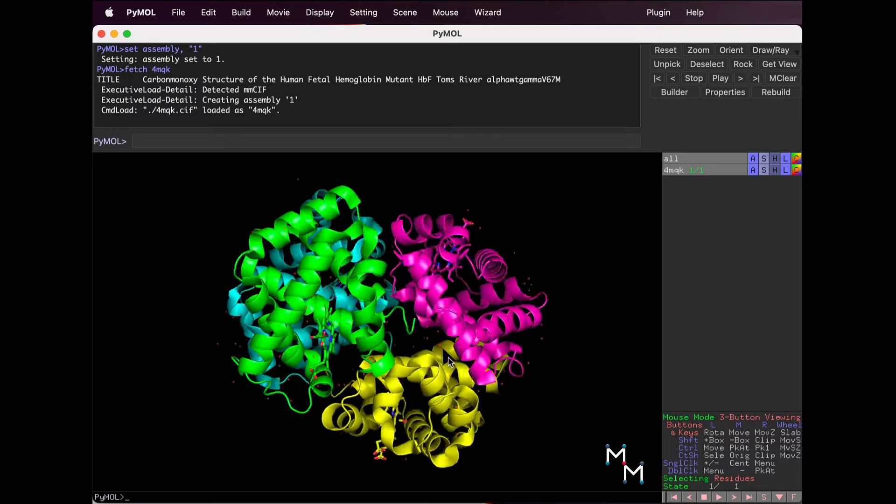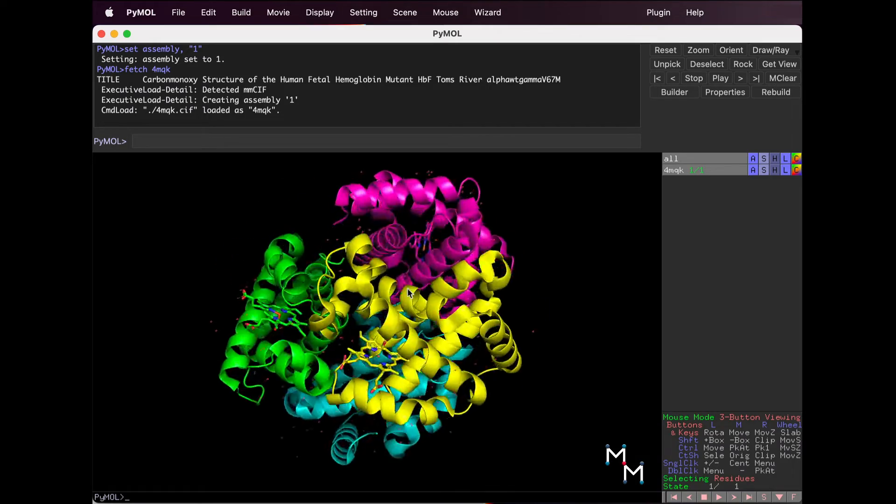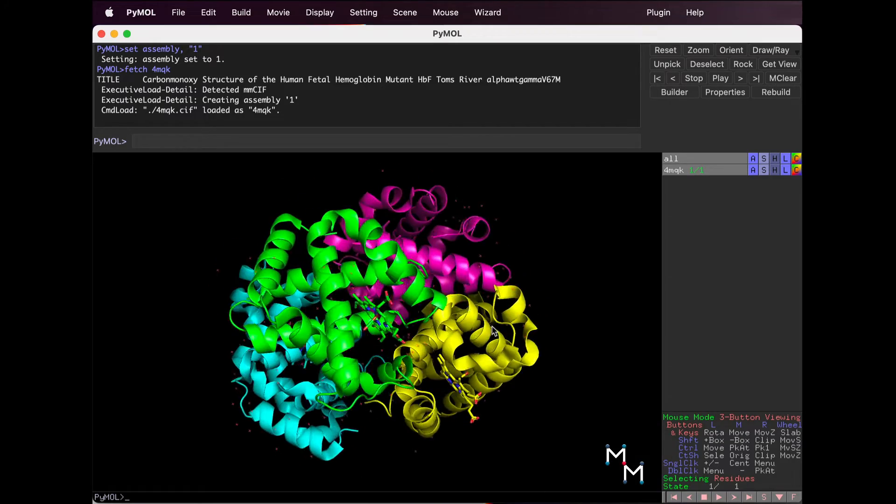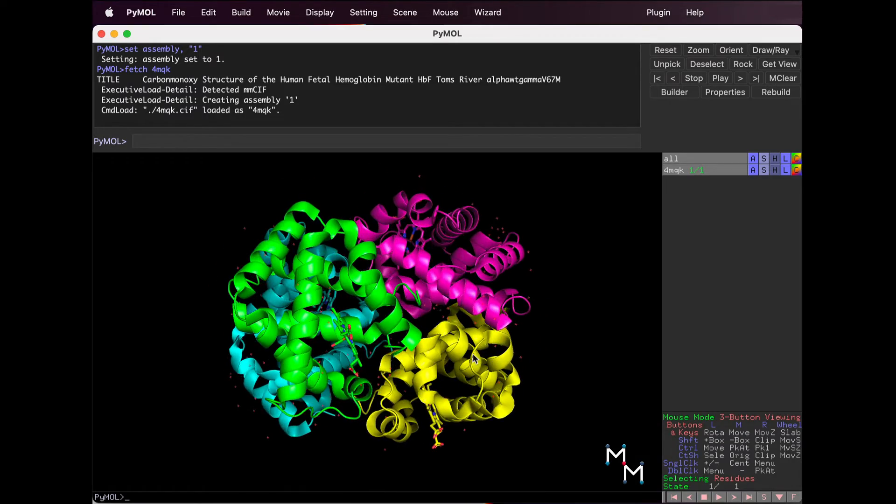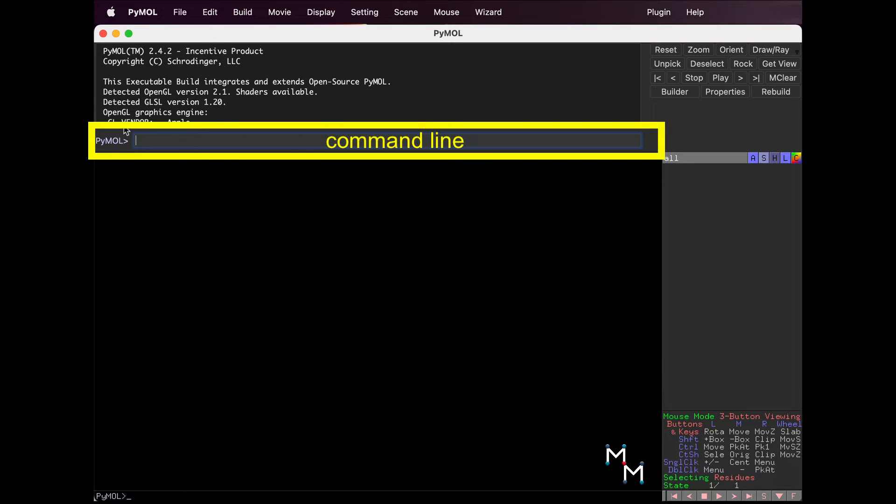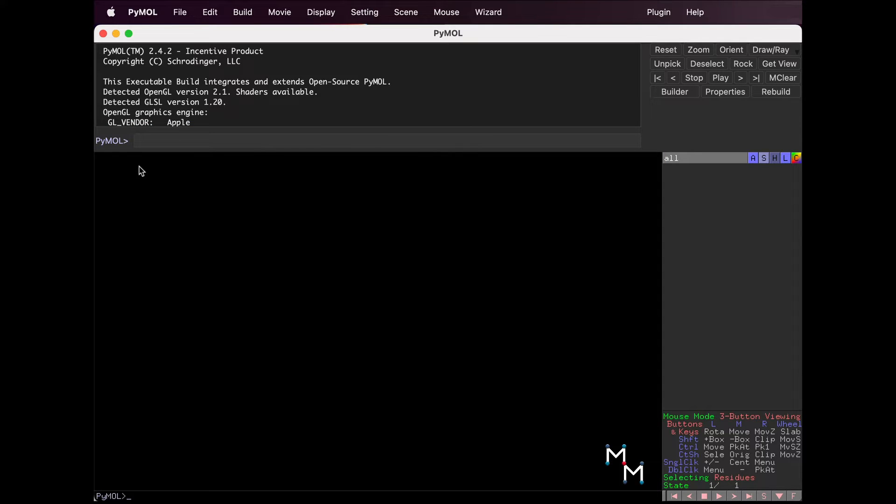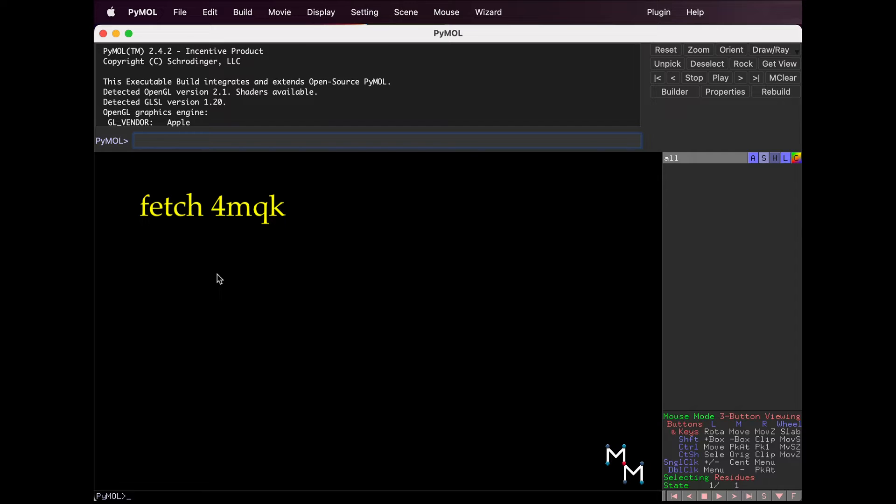A faster way to load structures is to use the command line, where you can execute actions with typed codes. Type Fetch, followed by the four-digit alphanumeric PDB ID.